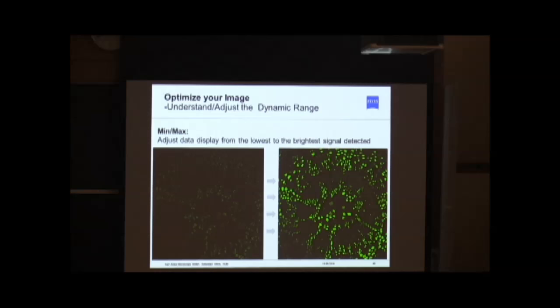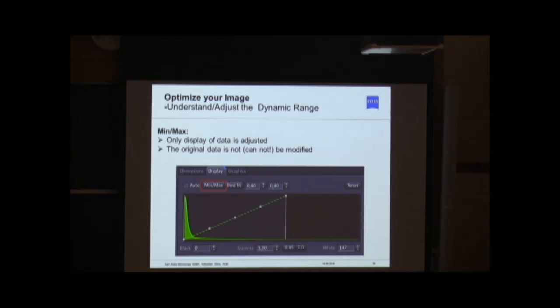Keep in mind, because many people ask me whether this min-max button changes my original data, the quick answer is that it doesn't change your original data. It only changes the display of your data. The original data is still kept, and if you open your data file, everything is as it should be. So there's no need to avoid the min-max button for fear of invalidating your data.